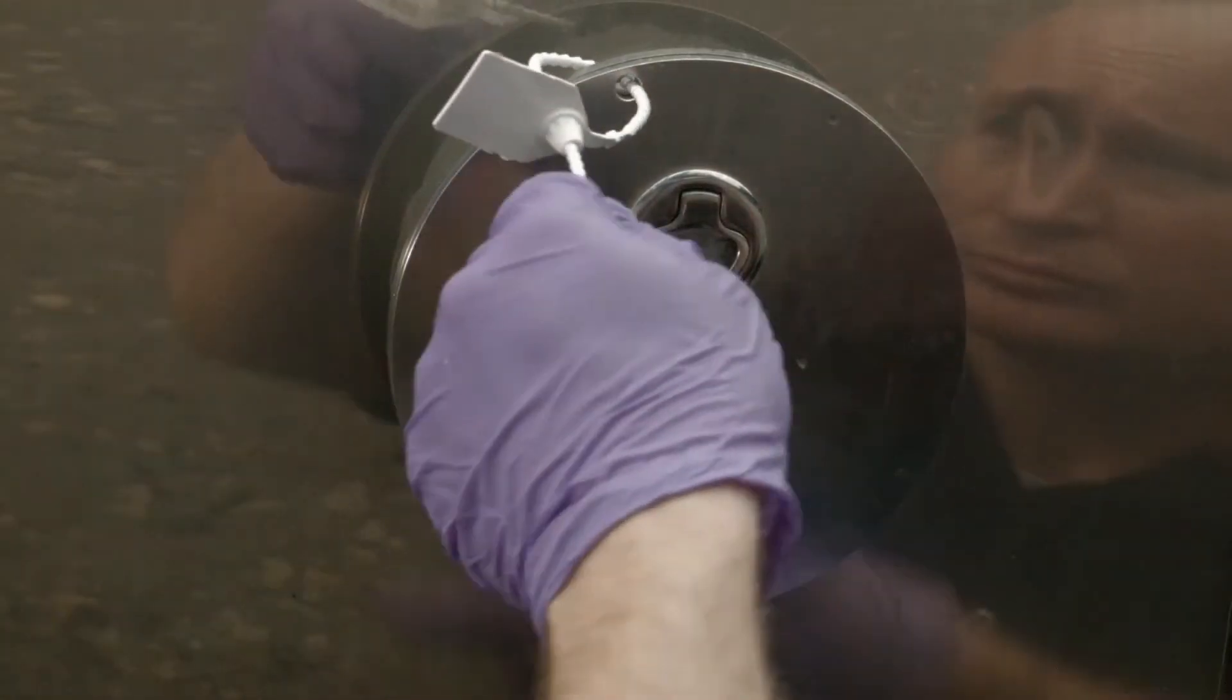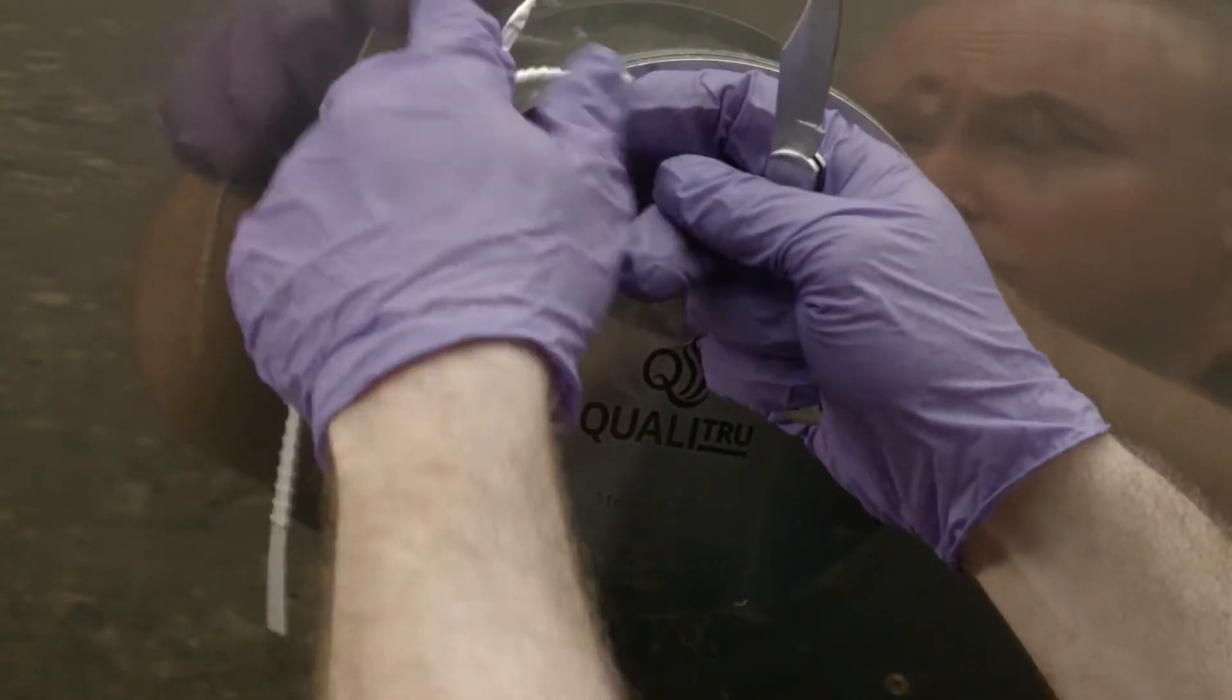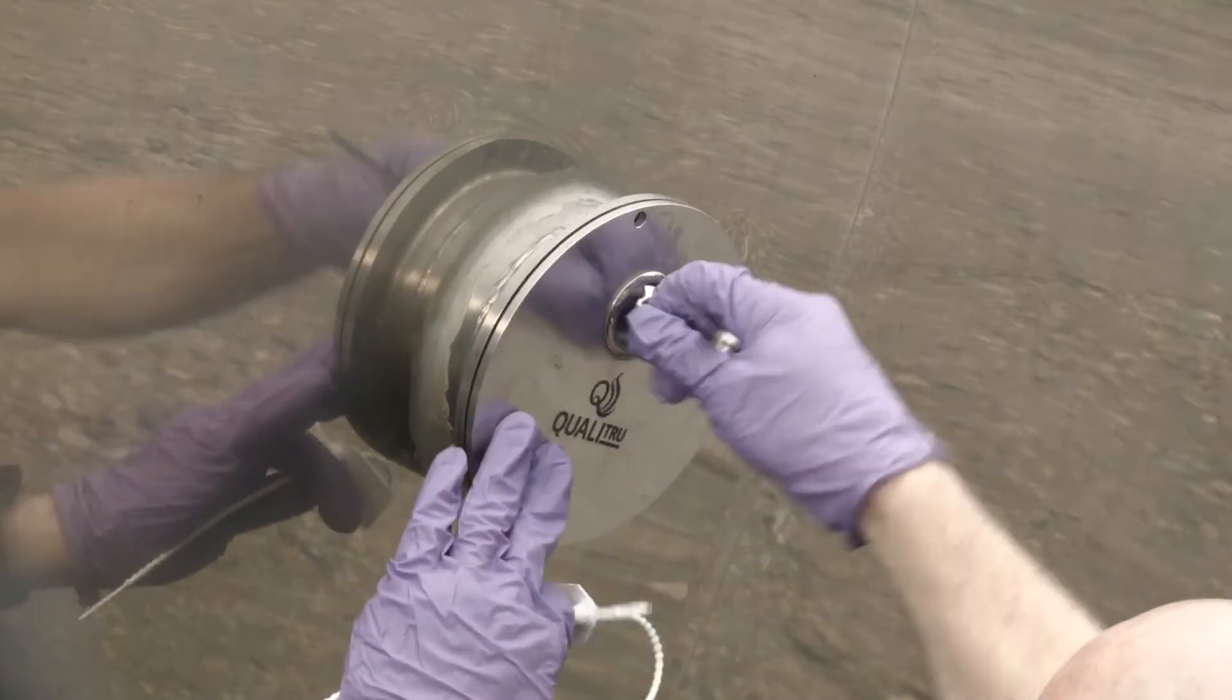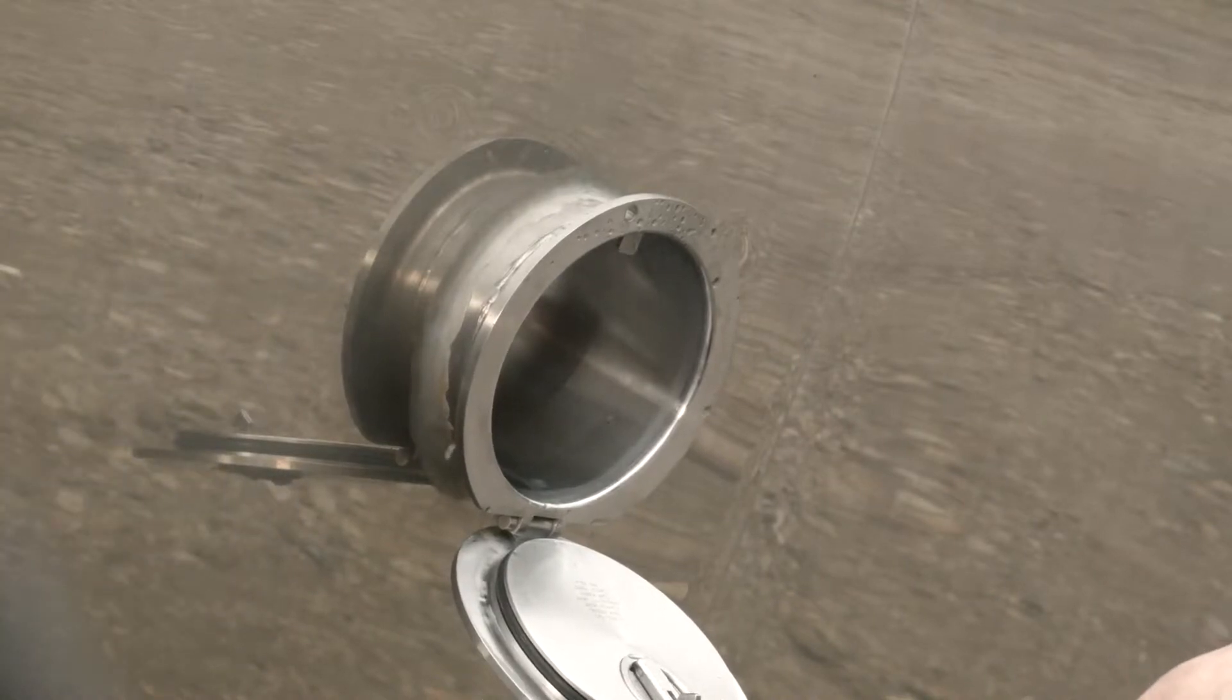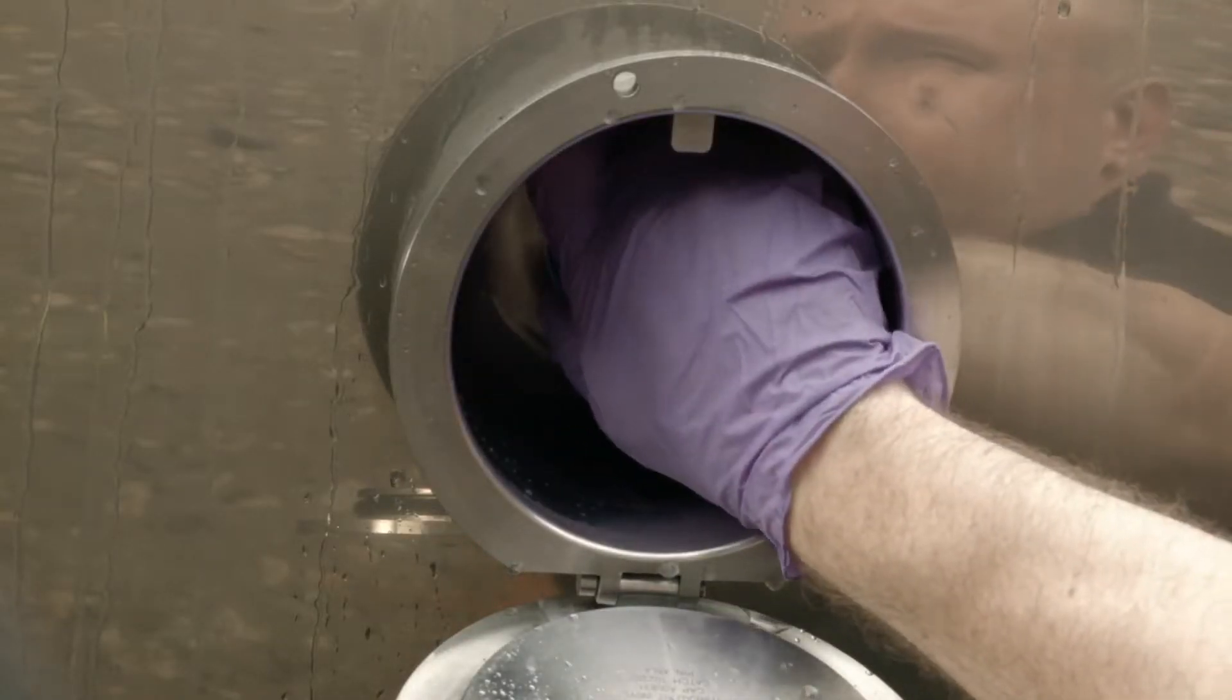Next, open the security lid on the QualiTrue Stainless Steel Sanitary Recessed Tanker Truck Port or access the QualiTrue fitting and remove the dust cover to gain access to the QualiTrue Sterile Septum.